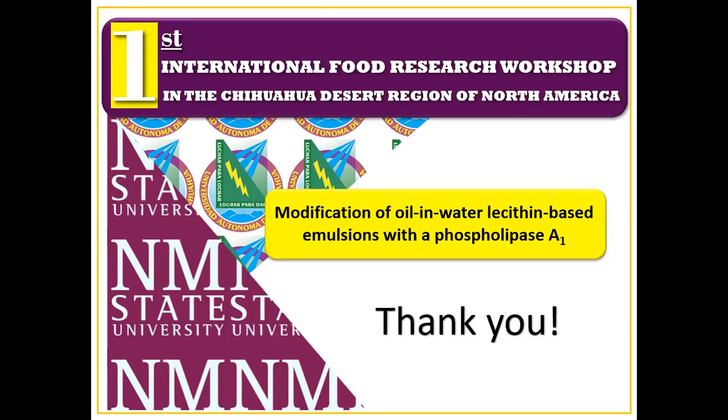Well, you said that you used ultrasound with and without phospholipase, right? Yes. Is there any chance that, because of the high temperature produced by ultrasound, the phospholipase might have changed its structure, which could have affected the result that you are getting?